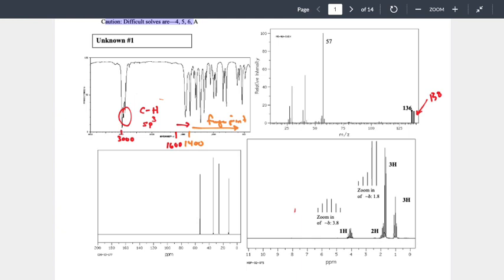Yes, sir. Maybe I zoned out when you were talking about it, but how do we narrow it down to just bromine and chlorine? Easily. We just look for the M plus 2. 136 was our M plus. Do I have an M plus 2? It's 138, so yes, I do. Now what we're trying to do is decide which of those 10 elements that we're responsible for in OChem have an isotope that is 2 units larger than the normal sample.